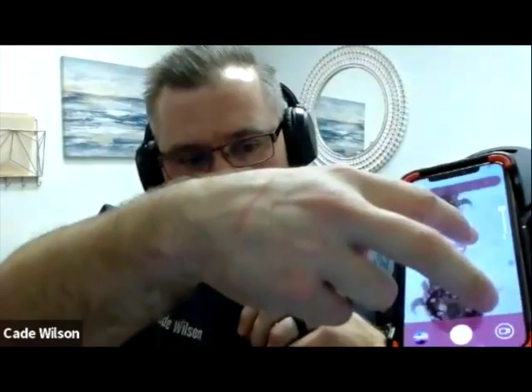I'll turn this around, everybody can see it. And so it just gives you a really easy way to use this as a viewer. It's a way for us to teach through or take pictures. You can use your optical zoom to get even closer to those specimens. You drive it just like you would drive your normal. I'm going to focus it here, but you can just drive it around. These are ear mites a cat donated to us just a few minutes ago, actually. It's nice of him.